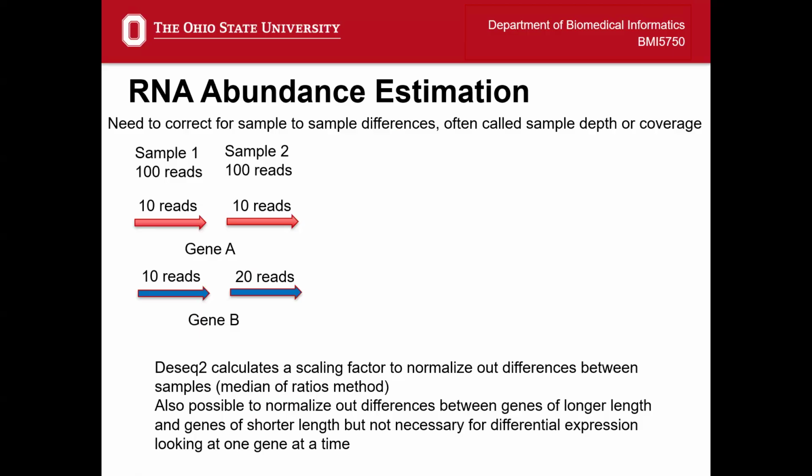It's a really easy thing to calculate in R. There is one function to adjust your p-values, but it's all taken care of within DESeq2, and we don't really have to think about it.